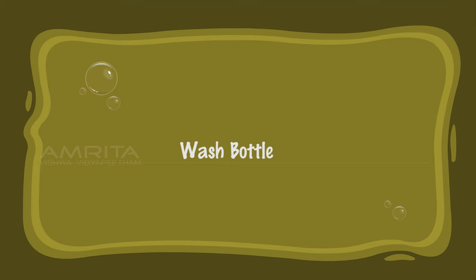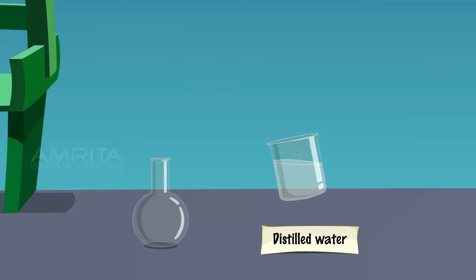Wash Bottle. Fill a flat bottom flask of 500 ml with distilled water. An appropriate cork with two bores is fitted into it.